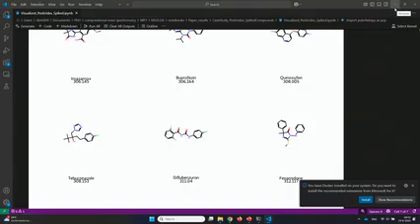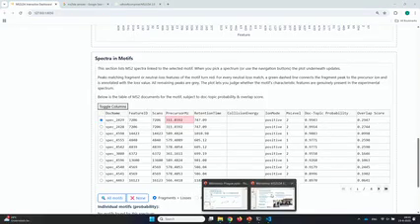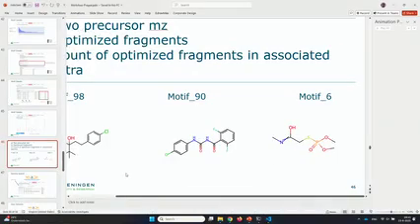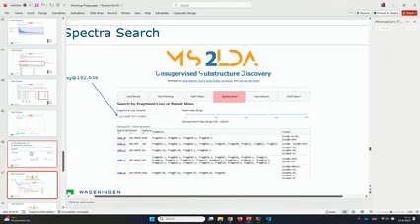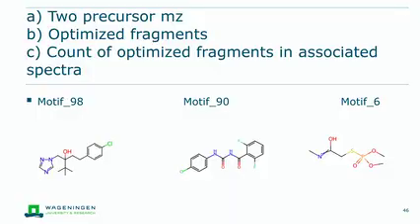We could also do this for other examples in principle. I mean, that was the idea, but I think also in terms of time, I will move on. And maybe, yeah, again, it's a little bit of a pity that it didn't work out as you maybe might have wanted to, but play around with it during the workshop if you have better internet.